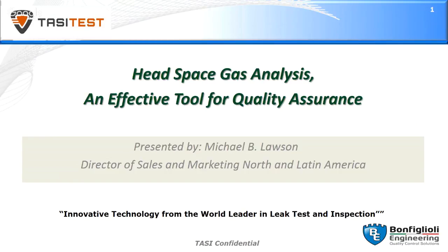So as Mike said, today I'm going to speak about Headspace Gas Analysis as an effective tool for quality assurance in lab equipment, but also in inline equipment, so in the manufacturing process. And this is a great technology. It's one of the newer technologies that's out in industry. It's been developed in the last 20 years, if you will. It started from university and worked its way out into industry.